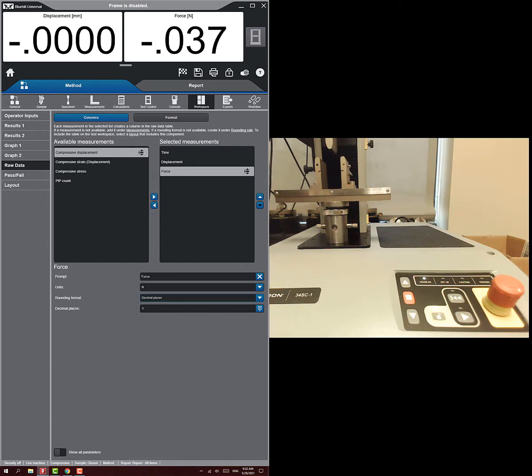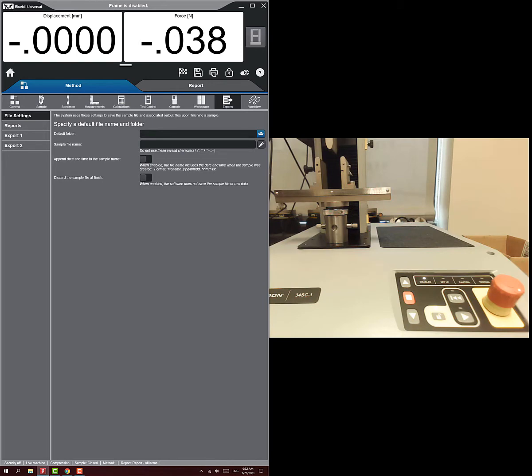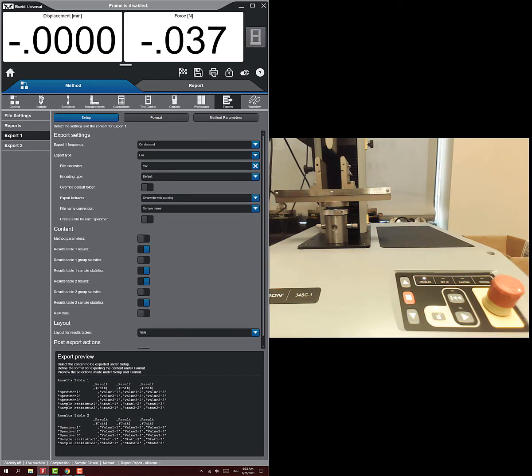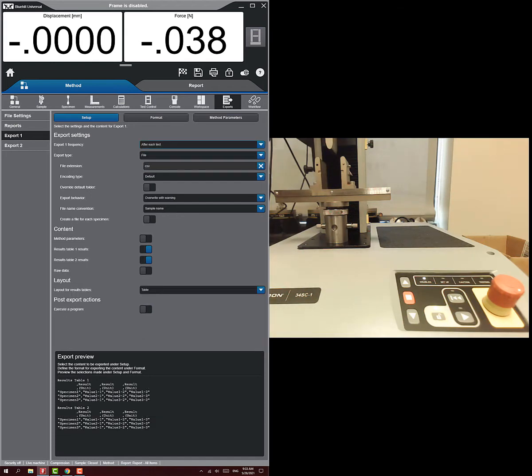Change the force units in raw data to newtons — this is especially important for softer materials like bone or plastics. Under exports, we want to export the raw data. I'll turn off saving the report since that's for company-formatted reports, and you'll be doing your own analysis. Set the export frequency from on-demand to after each test, so you don't forget — it will automatically export when the test finishes.